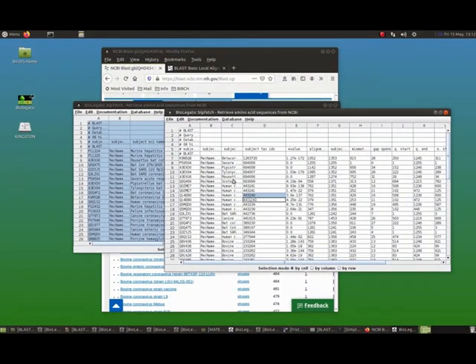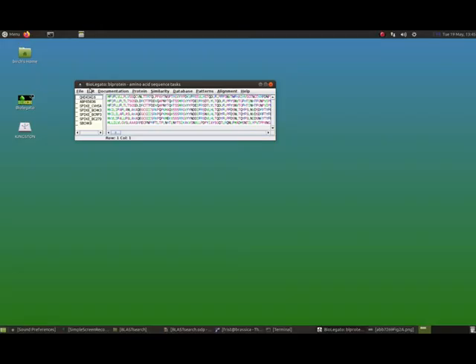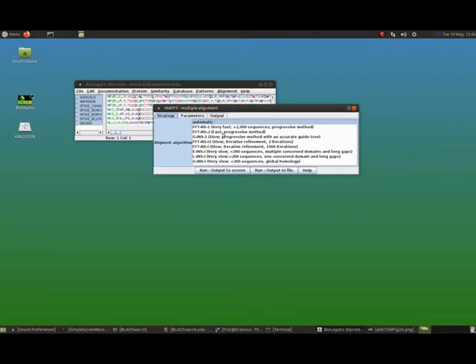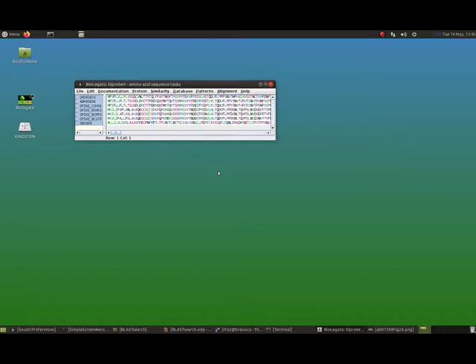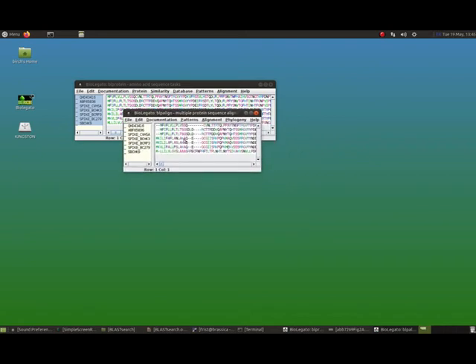So at this point, I think it's best if we go back now to the hits we retrieved and take a look at some of the downstream analysis that we can do. So to do our multiple alignment, we just have to select all of the proteins in BL protein, and then in the alignment menu we run MAFFT, which is going to be using the fast multiple alignment that's the default, and output goes to a BLP align object, which is the BioLegato object for multiple protein alignments.